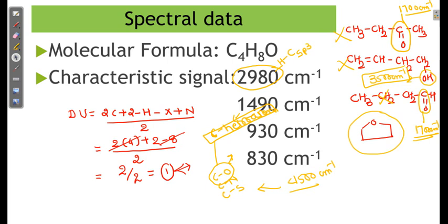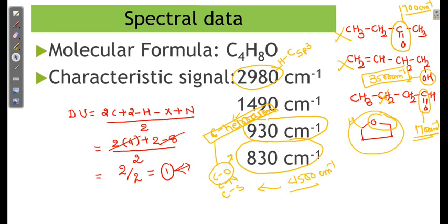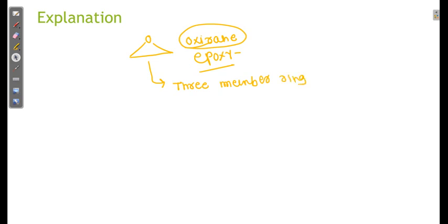Now, the remaining possibility fits because this has SP3 carbon-hydrogen and carbon-oxygen. But what about the 930 and 830 cm⁻¹ signals? When there are signals at 930 and 830, if I have an oxygen structure, this is oxirane or I can say epoxy. This is a 3-membered ring and 3-membered rings are not stable.